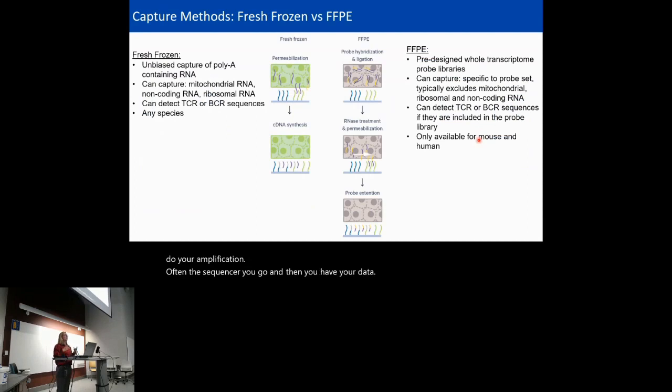So when thinking about the landscape of tissues out there in the world, I think it's not unobvious to think about all of those medical pathology samples that have been biobanked for many, many years. And the reality is that for most pathology samples, the method used is not a fresh frozen situation. It's generally FFPE, or formalin fixed paraffin embedded, right?